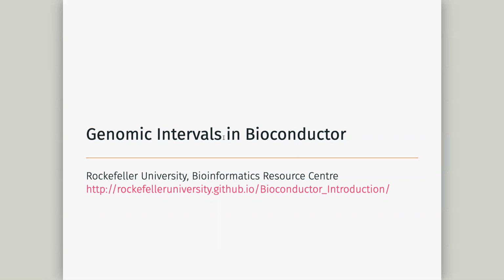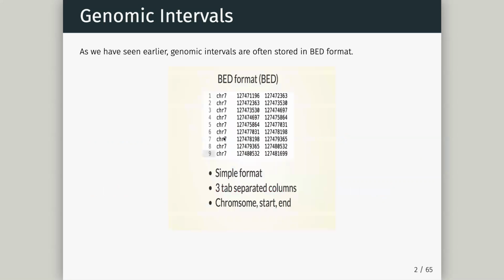Back when I first started doing high throughput sequencing analysis, these tool sets weren't available. So people were coding their own tool sets, often with slight bugs. A really famous tool set for doing this, and I'm not sure if anyone knows it, with a slightly strange name, is bedtools. Tools for operating with bed files. There is a whole set of tools using that, and that's shell-based to just run on the command line. For me, Genomic Ranges is pretty life-changing in terms of the analysis we can now do with it.